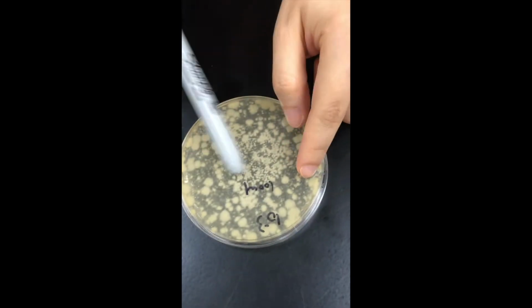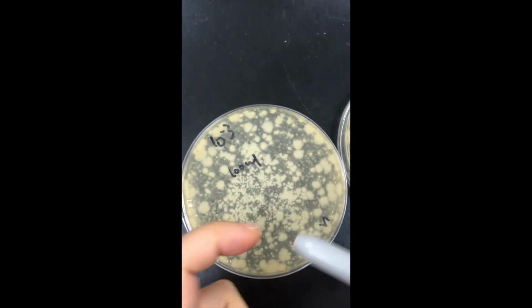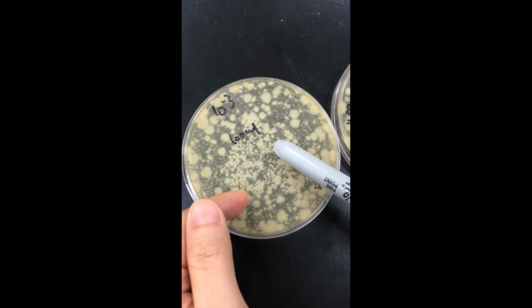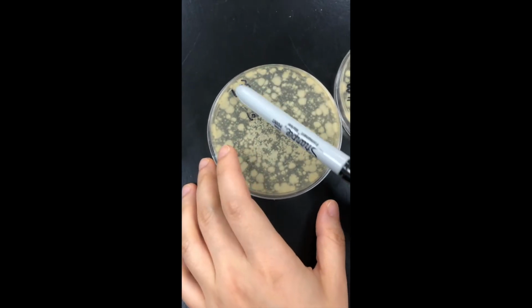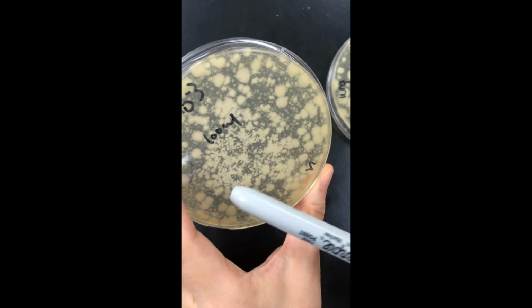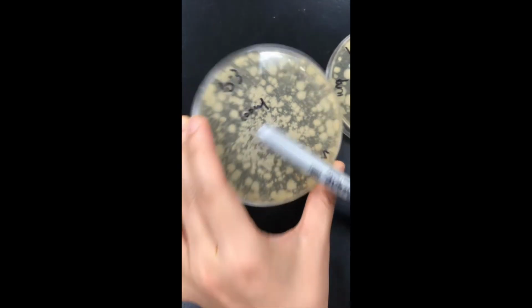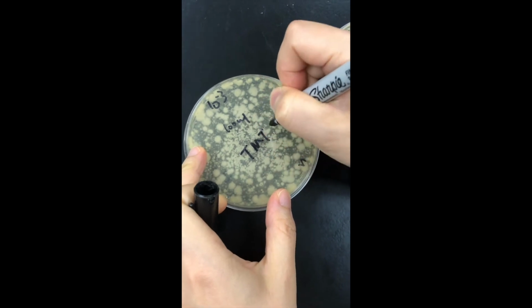So this is our unpasteurized raw milk sample after we mix the milk sample with our molten agar. Showing you here is the 10 to the minus 3 dilution sample. You see all the colonies. It's too many to count. I will not count this plate.